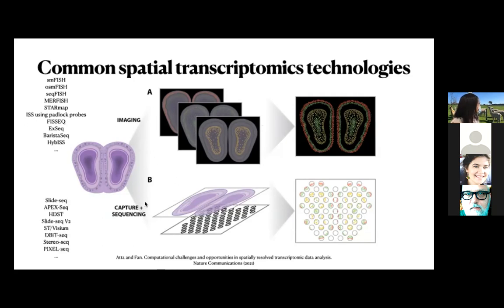Yeah. And another method is based on the next generation sequencing method. Basically for that, as you can see, there's the spatial array, and inside of each spot, there can be multiple single cells. So this is the next generation based method, and a lot of methods also are proposed here. I think, for instance, Slide-seq version 2 was just published at the end of last year, and also for Visium, they're gonna have a Visium HD to be published next year. So a lot of exciting opportunities here.